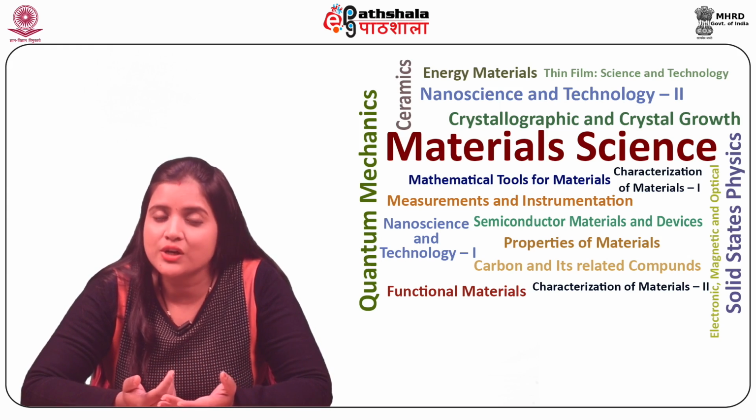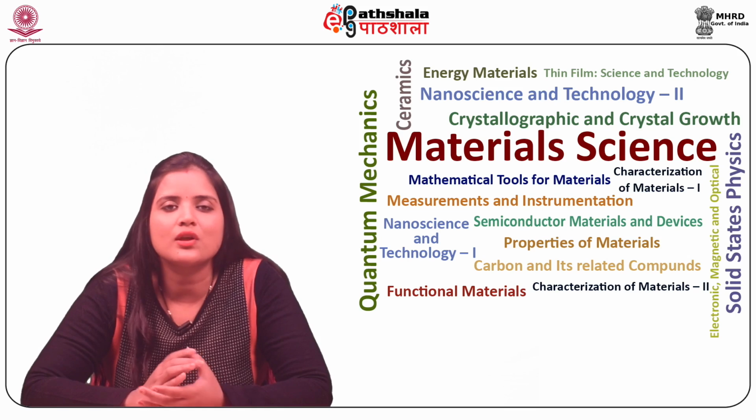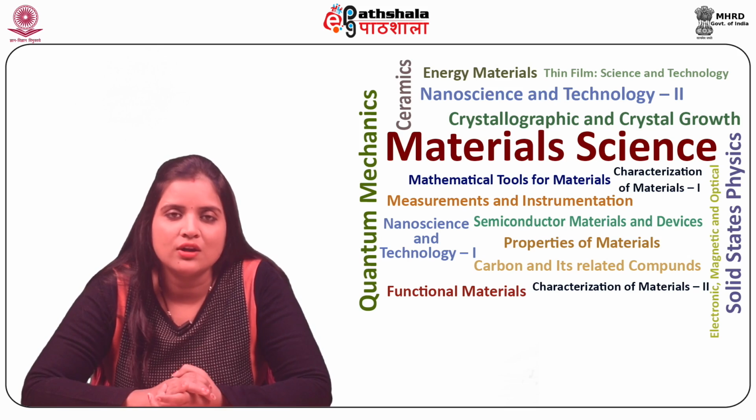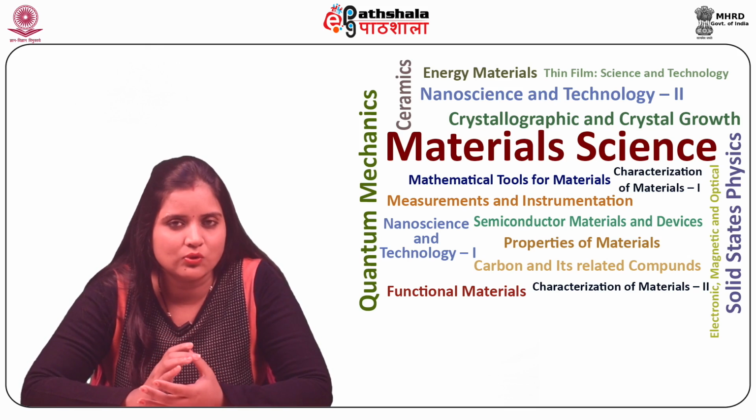Most of the manufacturers immerse the objective in the oil while optimizing the particular oil to be used in microscopes.